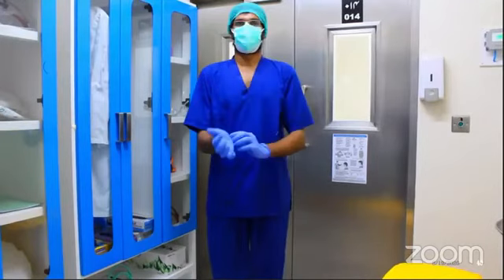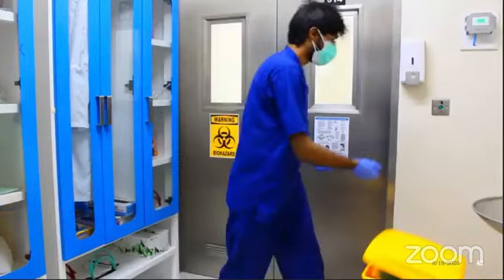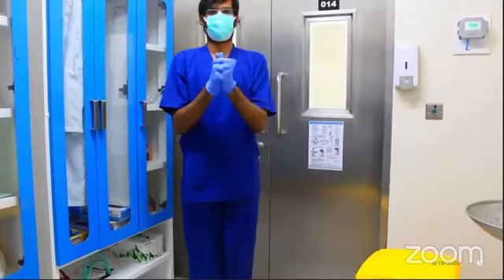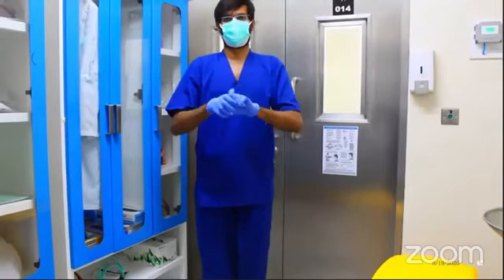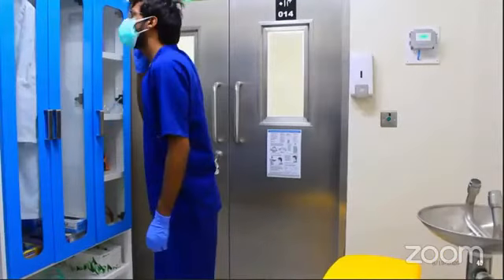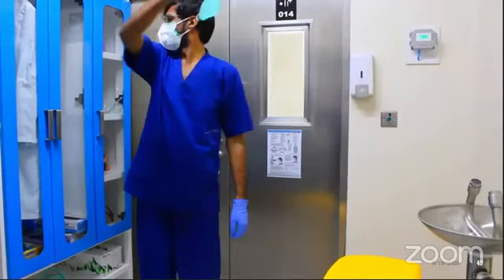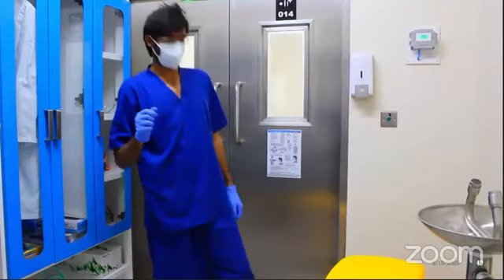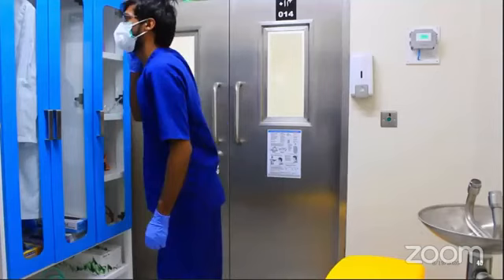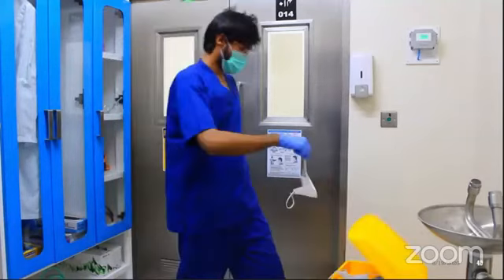Now remove the outer mask by grabbing the bottom tie or elastic strap and discard it. Disinfect the gloves in the same manner. Now remove the surgical mask, N95, and discard it.